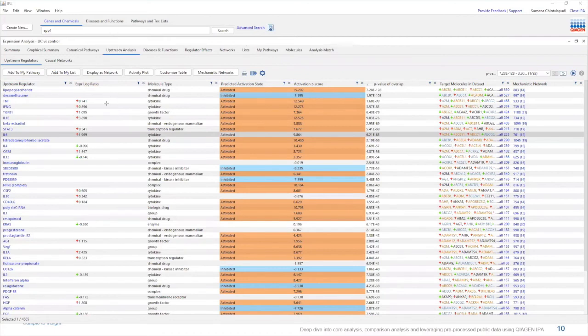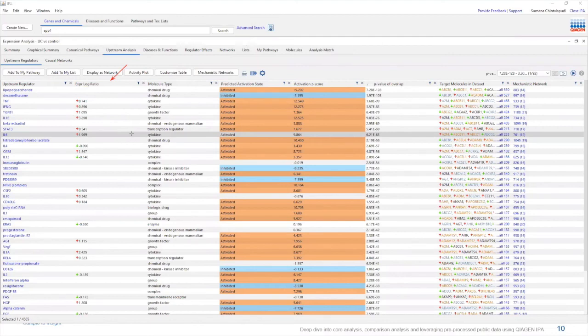Let's take a look at the expression log ratio column here. If an upstream regulator is present in your data set and has an expression data for it, its fold change values will be listed here. All these regulators with expression log ratio values are coming from your data set.